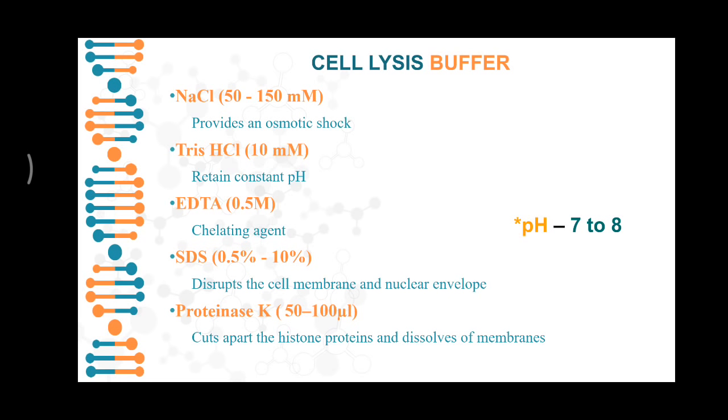Then EDTA. EDTA is ethylenediaminetetraacetic acid, a chelating agent which is widely used in molecular biology experiments to sequester divalent and trivalent metal ions such as calcium and magnesium.